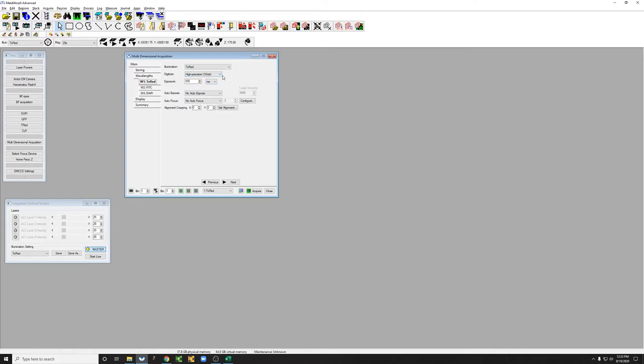One is the digitizer, which you should always leave to high precision 16-bit, and the other is the exposure. This camera doesn't really have any other settings, and so we're just going to leave it there.